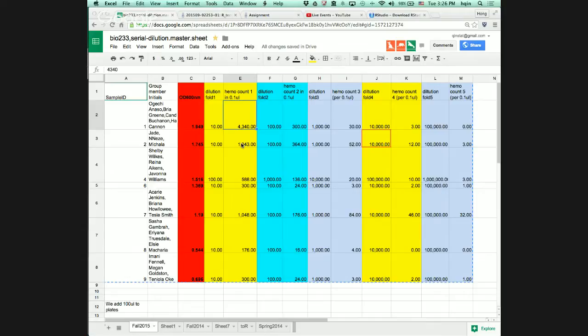And on an Excel sheet, this is your cell counting in a 4x4, and that's your dilution ratio. You divide by the 0.1, that's the concentration for the small tube you're counting. And that small tube is the dilution from the glass tube, the big one. You times that, that's the concentration in that large glass tube. That's basically what the software is trying to do.